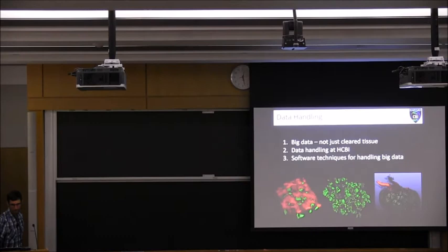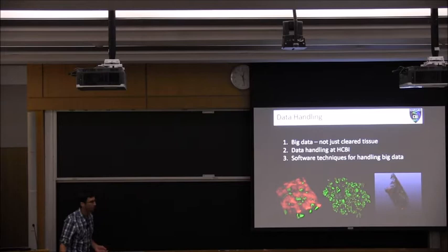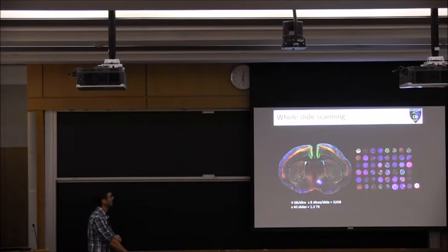Cool. So that's how we image this tissue. What I want to talk to you about for the second half is what do we do with all the data? And so, like I said, this isn't just a light sheet problem or just a clear tissue imaging problem.